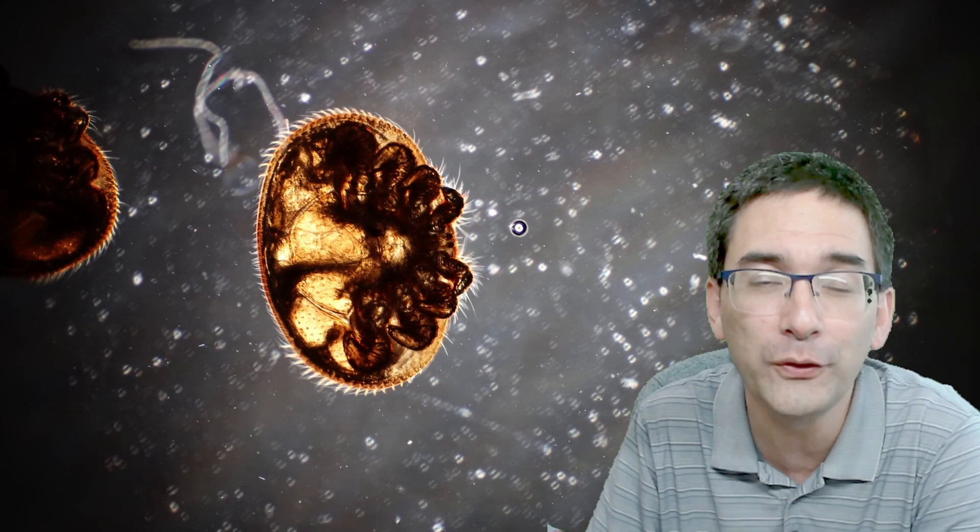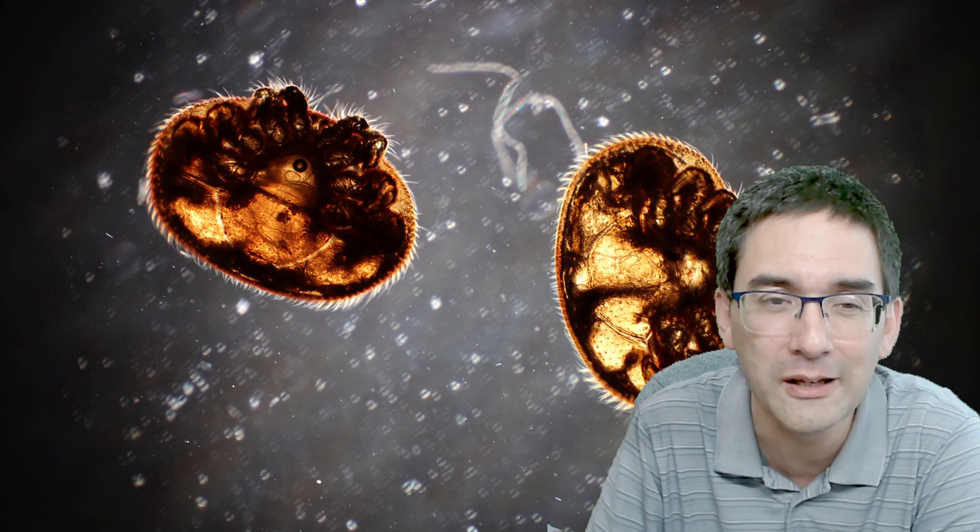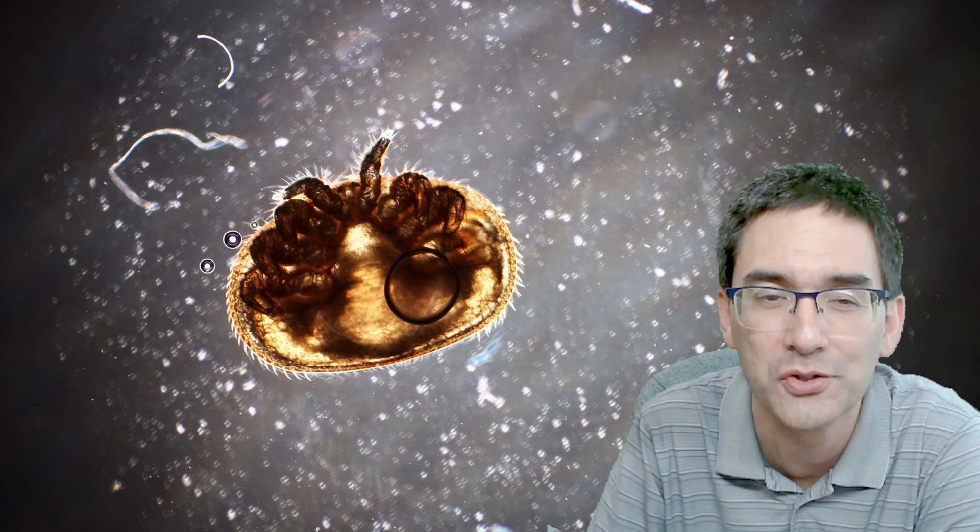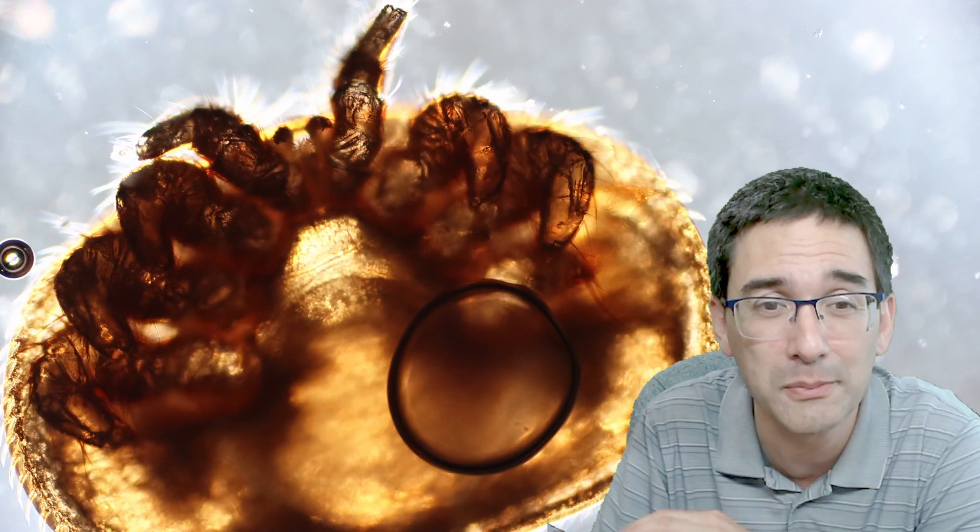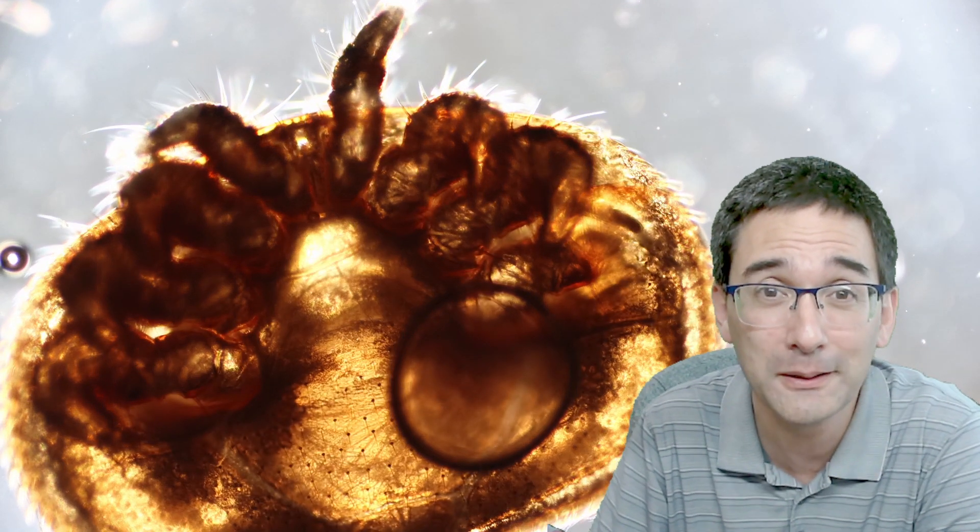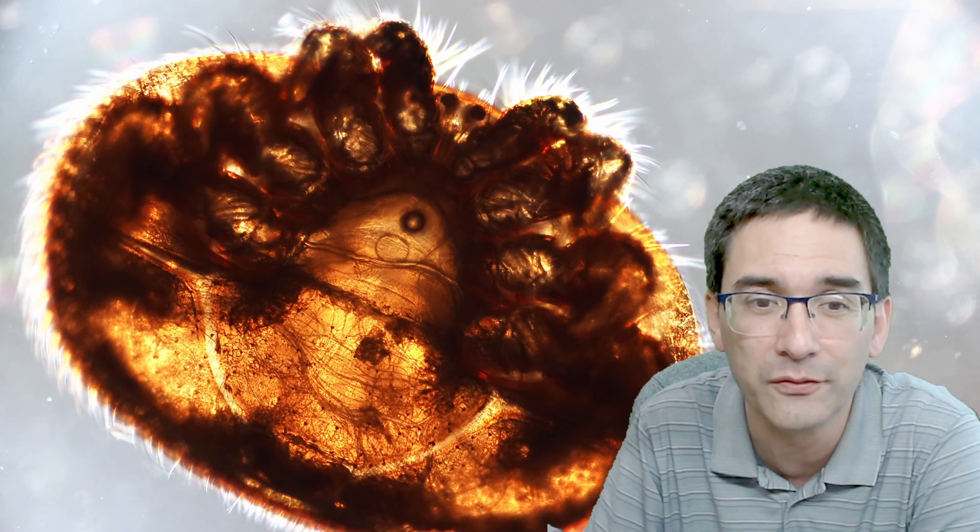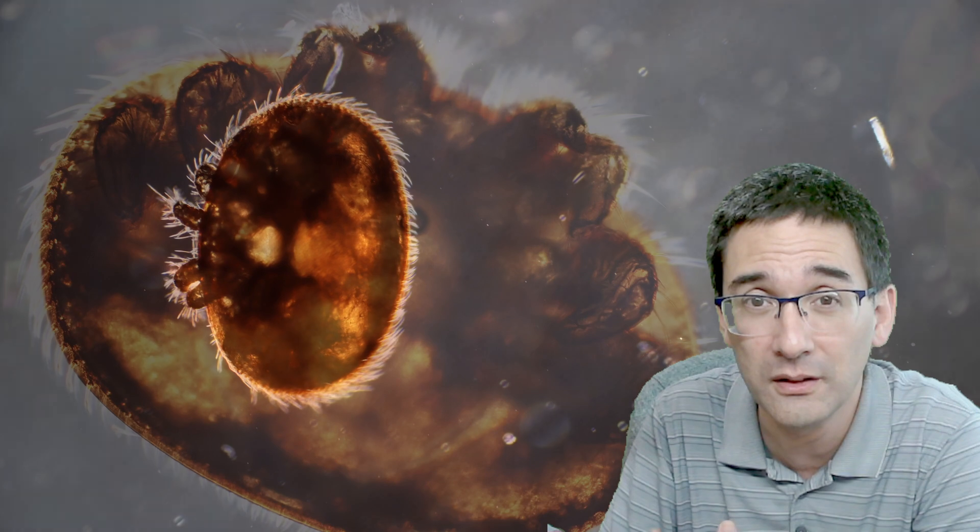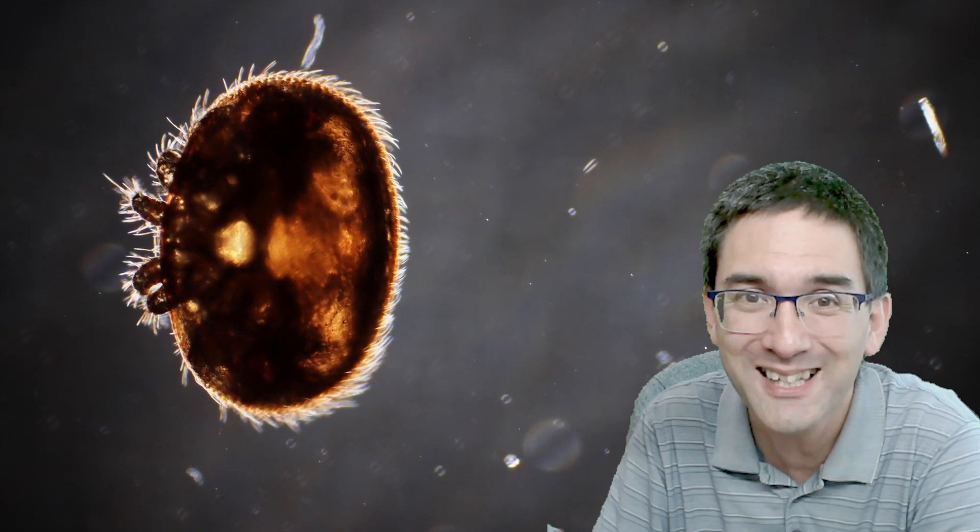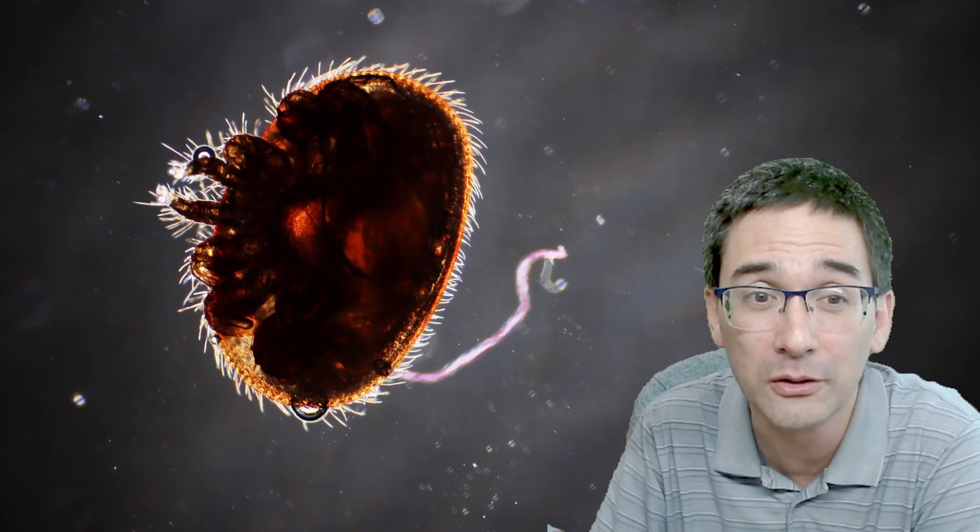Under the microscope this is what I saw - dark field imaging. You see many white dots in the background, that's all dust. This is using the 4x magnifying objective. We see those mites have many little hairs sticking out. It looks quite nice. Some air bubbles - the round things are air bubbles. But a little difficult to see some details because the mites generally were kind of dark and very pigmented, not very transparent. This means looking into the mite and seeing some of the more detailed structures was difficult. You see where the legs are it's kind of dark. Other parts are much brighter, and the reason is I did not bleach those critters. Normally when the arachnid - mites are not insects - when they're too dark, you have to bleach them and make the exoskeleton brighter so more light can go through.